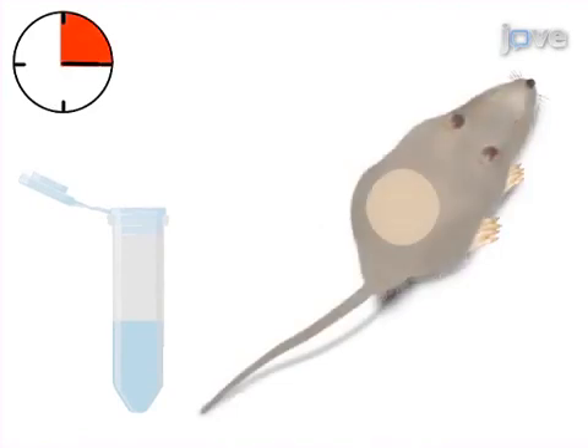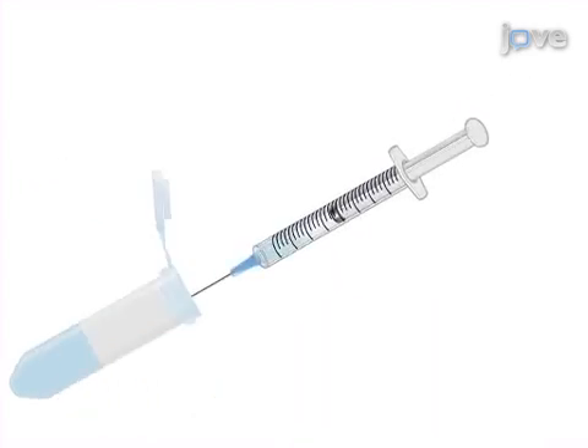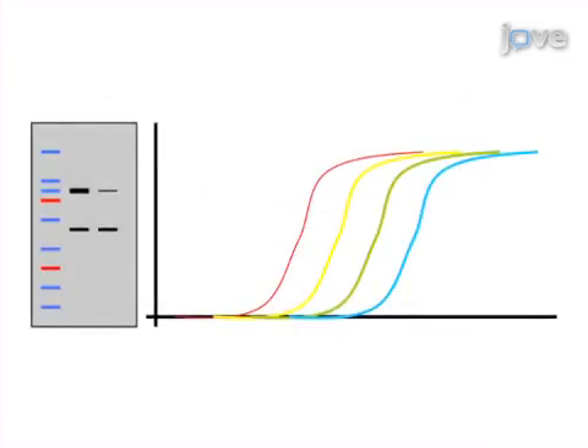After at least 15 minutes of incubation time, the siRNA-mixed solution is drawn into a Hamilton syringe. The final step is to carefully perform the intrathecal injection, repeating the injections once every 24 hours to ensure optimal downregulation. Ultimately, immunoblotting and quantitative real-time PCR are used to show the successful downregulation in protein and mRNA levels from the siRNA transfection.